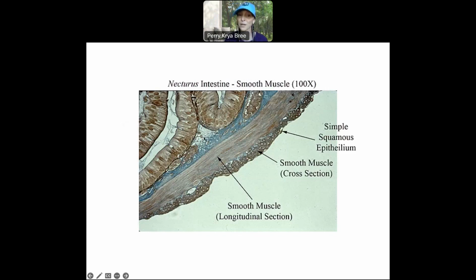You have some connective tissue here, connecting that epithelial tissue layer to the outside wall, which will be that serosa we talked about, with that simple squamous epithelium. So you have lots of different tissue types here. It's a good slide to review all those tissue types.